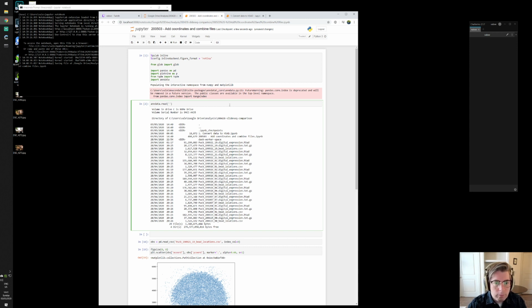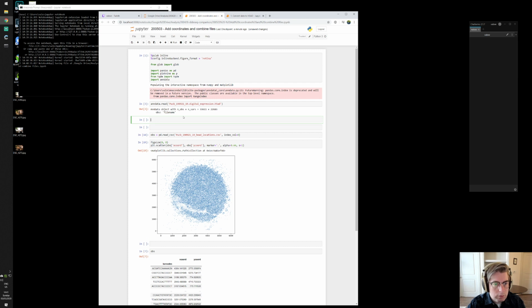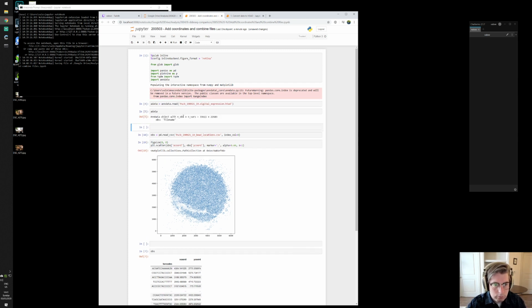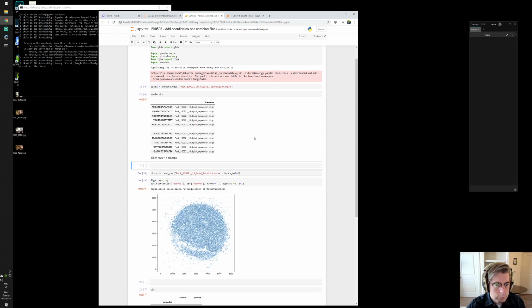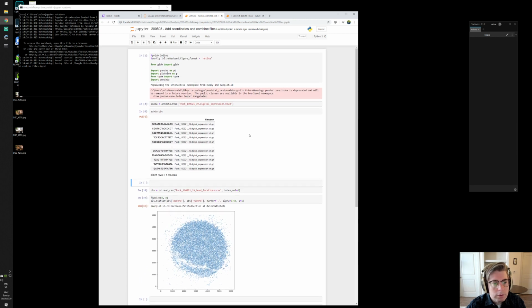So just to check one of these files, I'm going to load one of the pucks. Oh yeah, and it even has the file name annotated, that's nice. We will be able to use that later to add annotations.